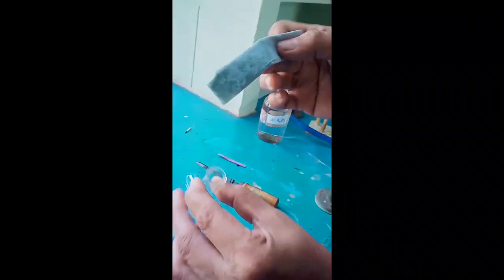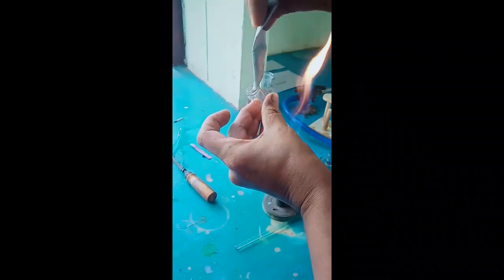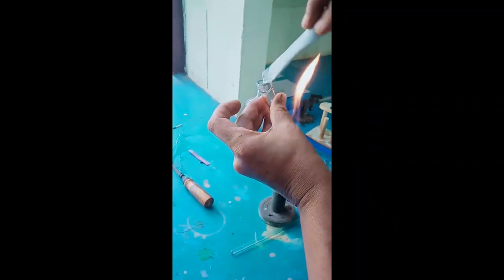Another acidic gas is hydrogen sulfide. The gas produced in the test tube is colorless. The name of the gas is hydrogen sulfide, which is acidic in nature, and the gas has a rotten egg smell, and this gas is tested using a lead acetate paper. This is a paper dipped in lead acetate solution, which is shown to the mouth of the evolved gas. The observation is the paper turns silvery black.